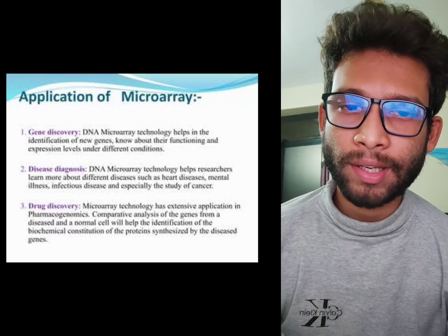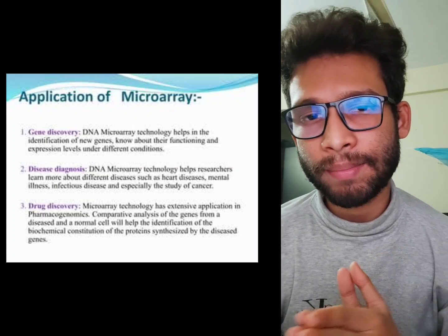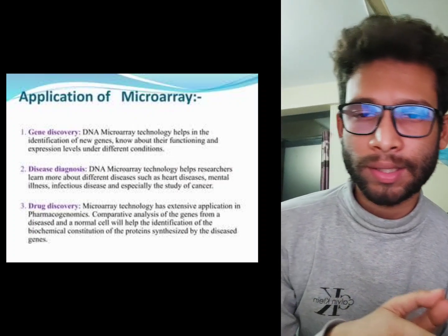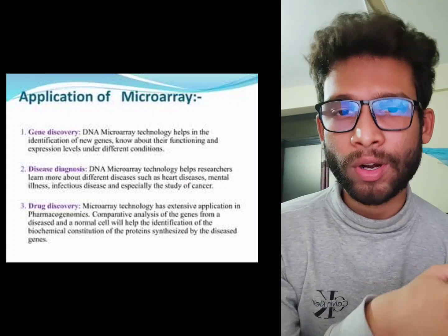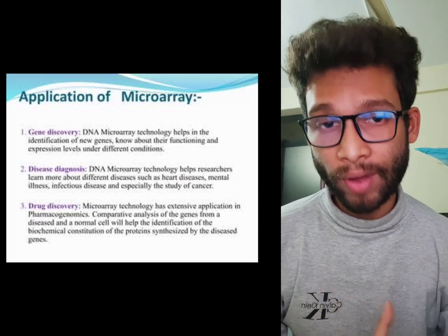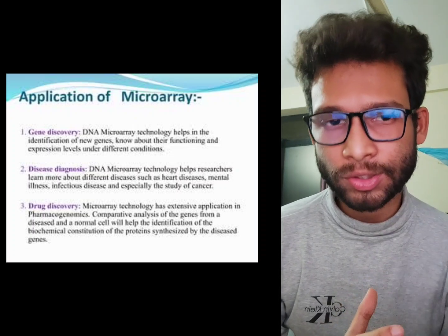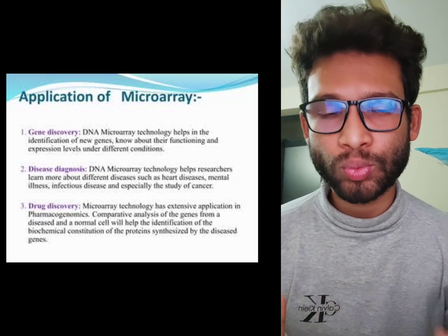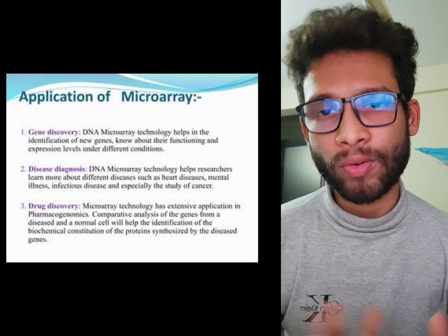This technique is useful for understanding the mechanism of diseases like cancers, and we can know whether genes are overexpressed or underexpressed. By comparing gene expression, we can identify biomarkers or potential drug targets. So this process is really useful for drug discovery also.